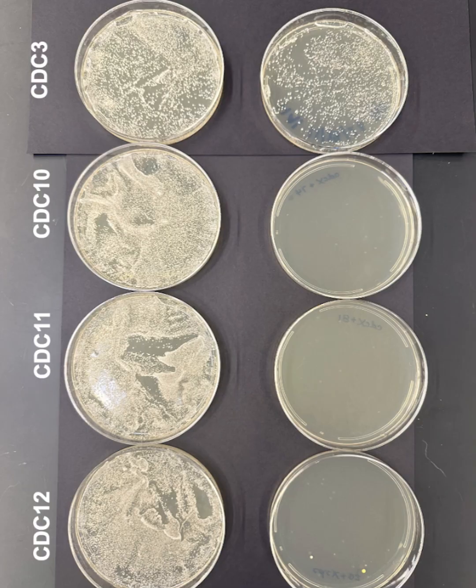By the end of this experiment, with other students, we can determine which septin gene is defective, based on whether the wild-type gene complements the mutant phenotype. It turns out to be CDC3. A new record.